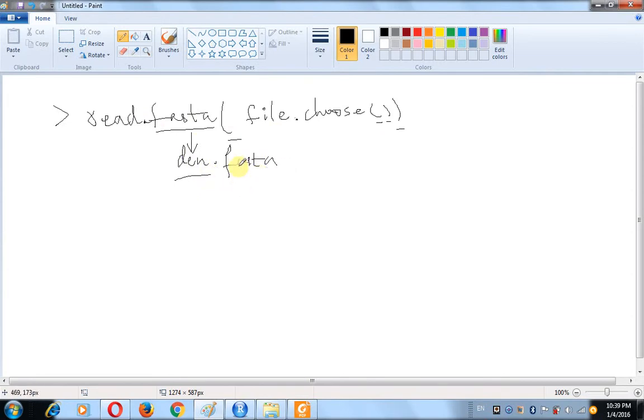You just have to spot that file in your drive, or maybe in the folder, and there will be a file inside R. So I'll tell you a very nice way of importing the file.